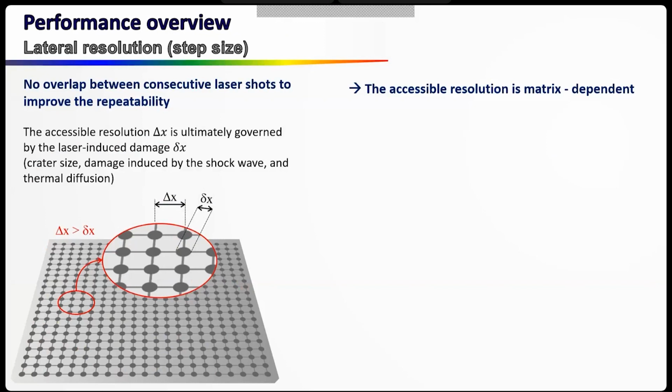So the first thing we can say on the resolution is that we want to work in the configuration for which there is no overlapping between consecutive laser spots.